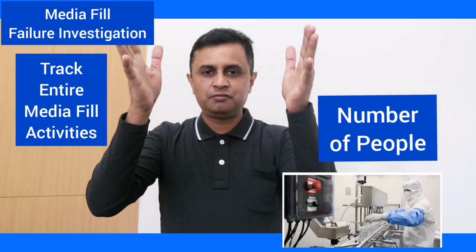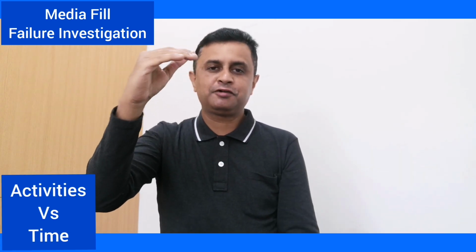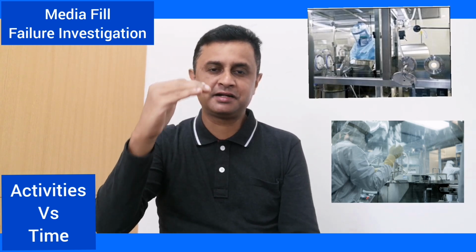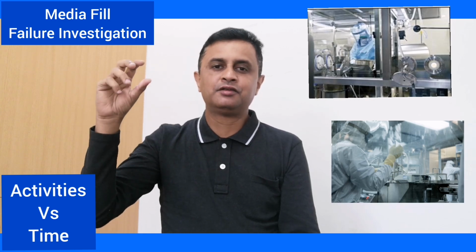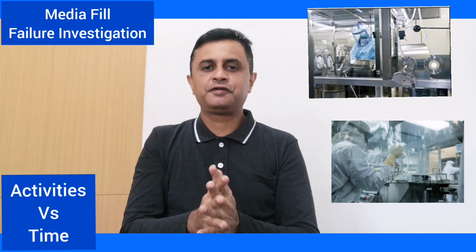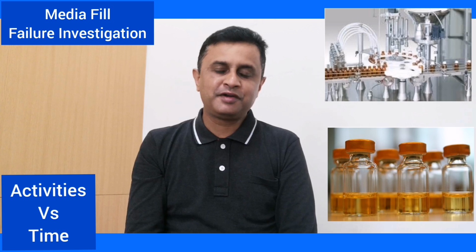We have to put everything in a table: assembling was started at this time, filling was started at this time, the number of interventions, the duration, and the persons involved. This gives a clear idea of the activity throughout the course of the media fill.